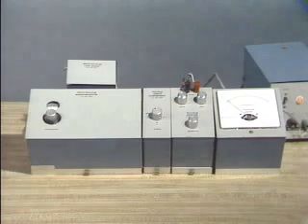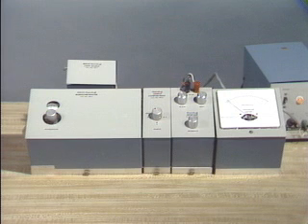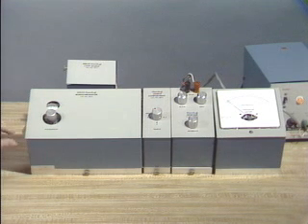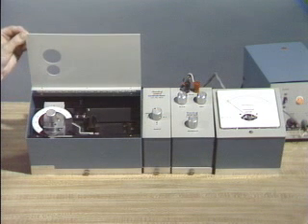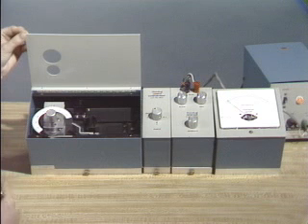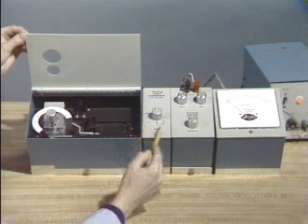In order to determine the amount of the absorbing species in this blue solution, it is necessary to study the ability of the solution to absorb orange light, its complementary color. The instrument to do this is called a spectrophotometer. It includes the components of the apparatus just seen. Although most spectrophotometers have opaque covers that are sealed, this one has been designed to illustrate the internal operation of the instrument. The basic spectrophotometer combines in one unit a spectrometer and a photometer.